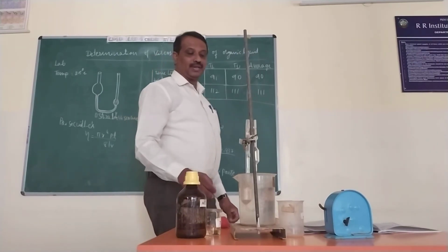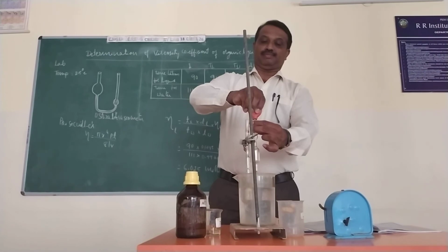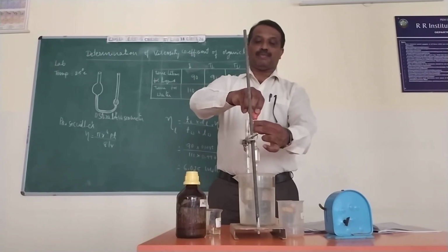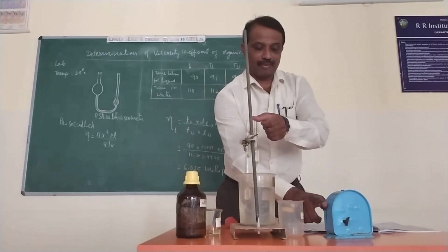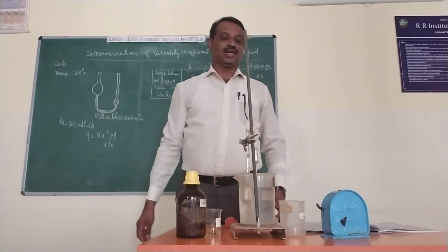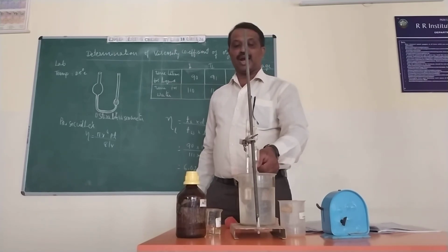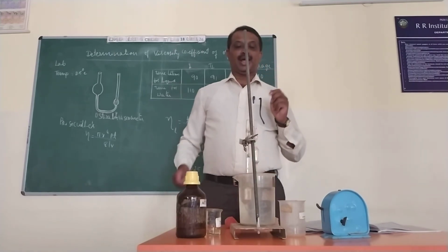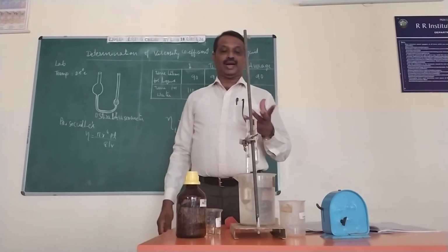Then we pass on to the second trial of the water. It is transferred from the larger bulb to the smaller one, completely filled. Afterwards I use the same stopwatch for the movement of the solvent from the upper end to the lower end. Note how much time it has taken very neatly. Don't neglect it.